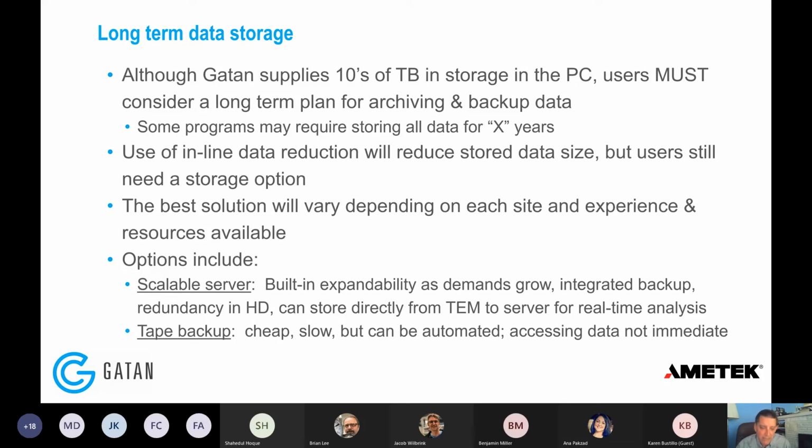You can do tape backup, which I think has historically been the default. It's cheap, it's slow, but it can be automated, and accessing the data depends on the system you have to a large extent. It isn't quite as simple as having the data on your hard drive or a server's hard drive that you can directly log into. So it's something to consider, but maybe that's long-term storage or long-term redundancy.